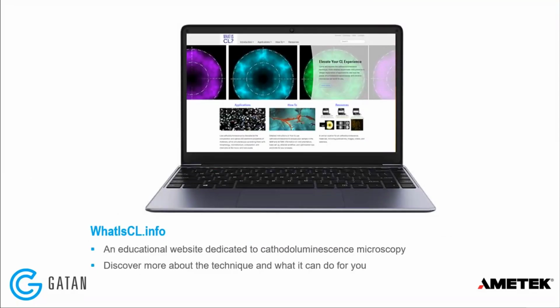Now, I'm coming close to the end of the presentation. If it's stimulated you to want to know more about cathodoluminescence and cathodoluminescence microscopy, I encourage you to visit a website that we've developed as an educational tool, which is whatiscl.info. It contains a lot of interesting information about some of the fundamentals of the technique, a lot of information about the applications, how people use this to answer a number of different problems from a wide range of different application spaces. It also includes tips and tricks and videos and instructional information, both in terms of hardware operation, but also data analysis too. So I strongly encourage you to look at this website if you're thinking of using CL, or you are a user, even an experienced user of CL tools.